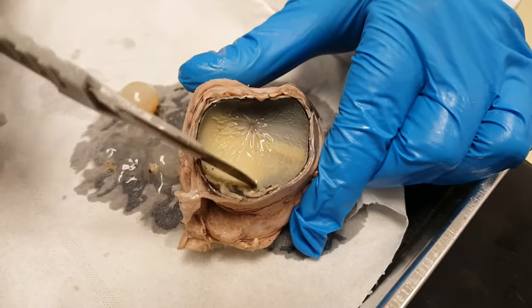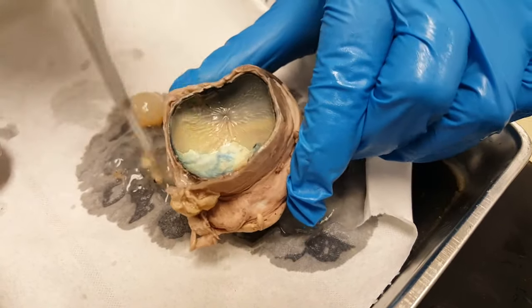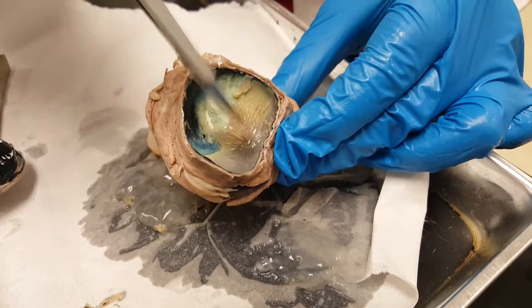On the backside we have this light-colored stuff — this is the retina. Notice how thin it is; you can peel it away. The blue stuff underneath is a reflective surface called the tapetum.